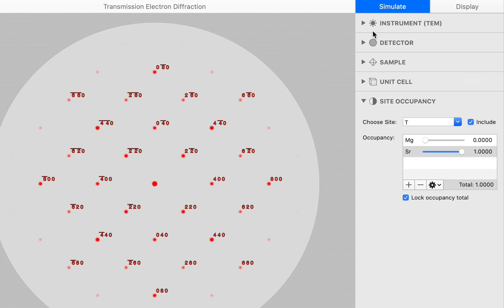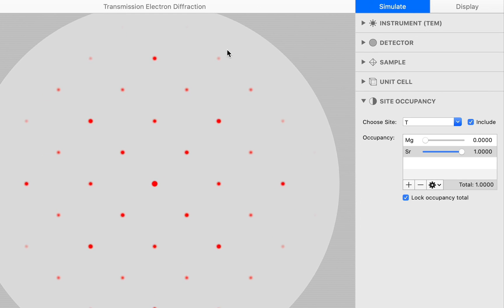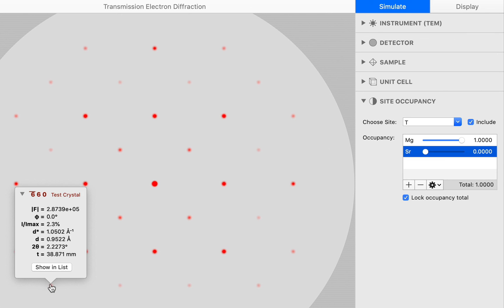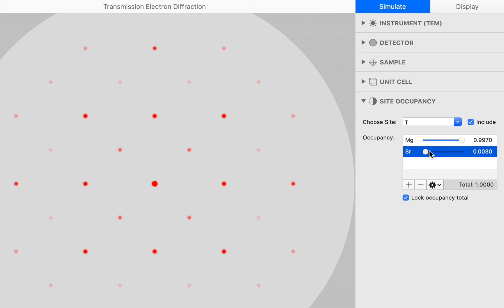We'll also hide the labels and zoom in a little. Now as we reduce the amount of strontium, some reflections — like bar 6 6 0 down here — get weaker; as we increase the proportion of strontium the intensities get stronger. Moving the sliders back and forth shows the intensities changing interactively. That's a quick overview of using Single Crystal to build a new crystal structure, view its simulated diffraction pattern, and interactively change parameters.